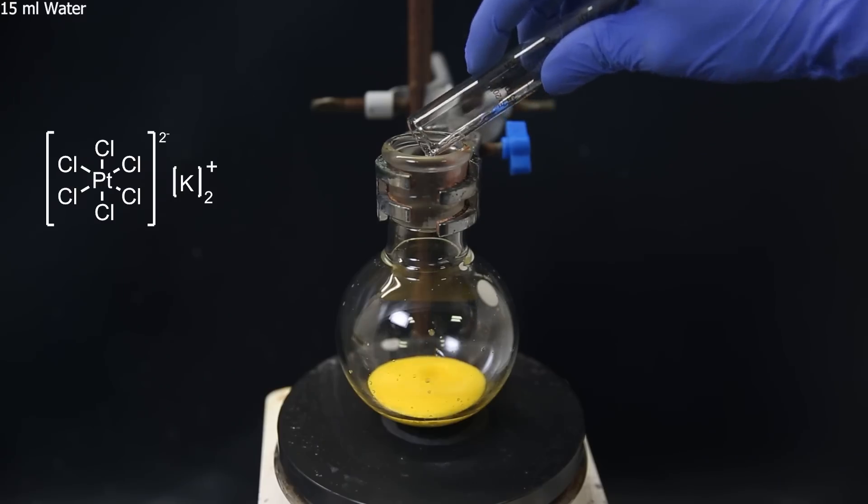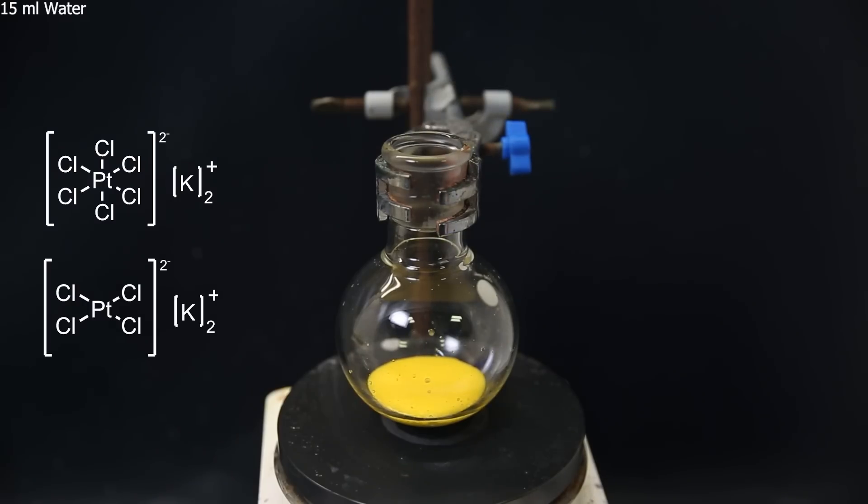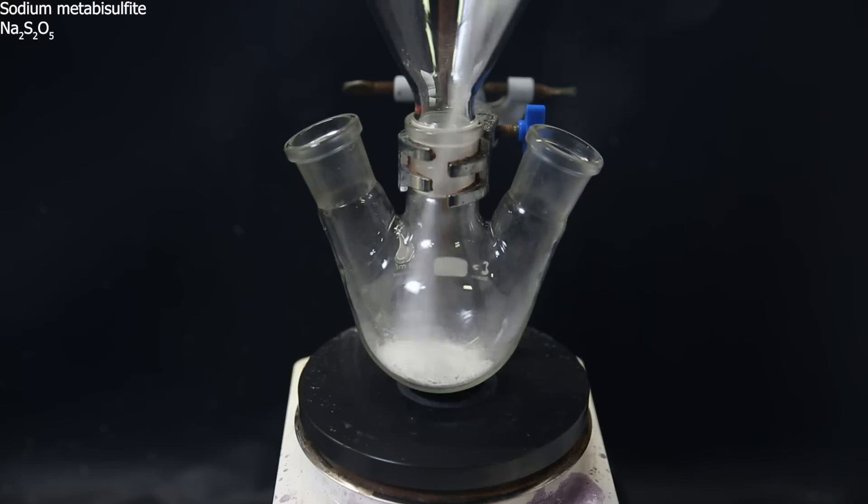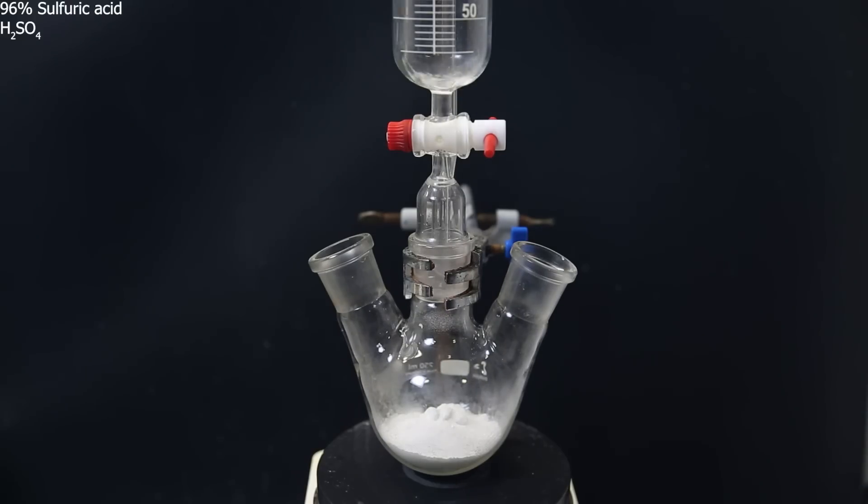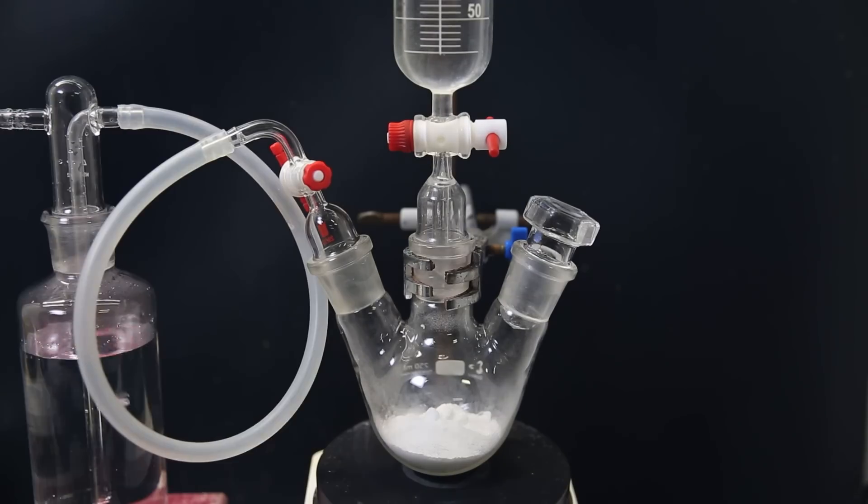Now to reduce the hexachloroplatinate to tetrachloroplatinate, I will have to prepare a solution of sulfur dioxide. So I set up a flask with a funnel and add in a random amount of sodium metabisulfite. Then on top, I add a dropping funnel, and into that, I add a random amount of concentrated sulfuric acid. I then attach a stopper and a gas adapter. And through the gas adapter, I connect a hose that leads to a gas washing bottle filled with water.